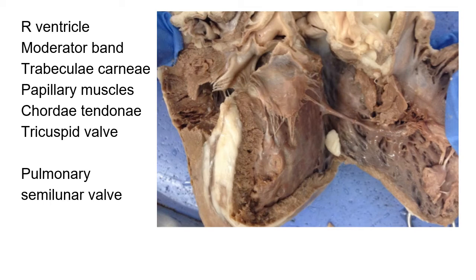Now in the right ventricle, I can see a couple of things. I can see this flap. There's a flap here. There's a piece of the flap over here. It looks like I cut a piece of the flap here. Attached to the flap are these strings. And then those strings, in turn, are attached to a finger-like muscle in the wall of that ventricle. Little trickier to see on the other flaps, but they're still there. So I have a flap, some strings, and the strings are attached to a finger-shaped muscle.